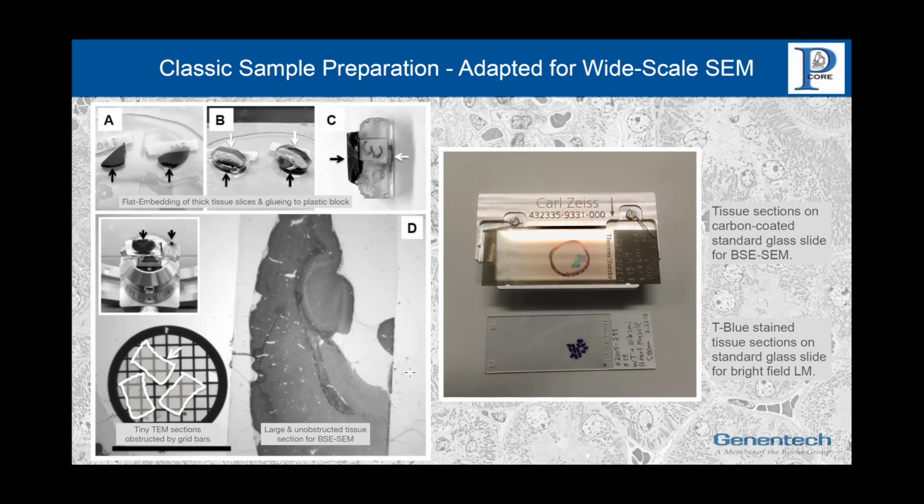Now, we usually prepare our sections on carbon-coated glass slides. In my experience, this has by far been the best platform. We have also experimented with titanium oxide-coated slides and other metal-coated slides, but in my opinion, carbon-coated glass slides are always superior.